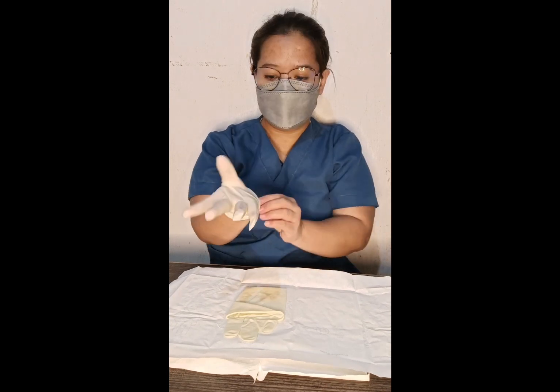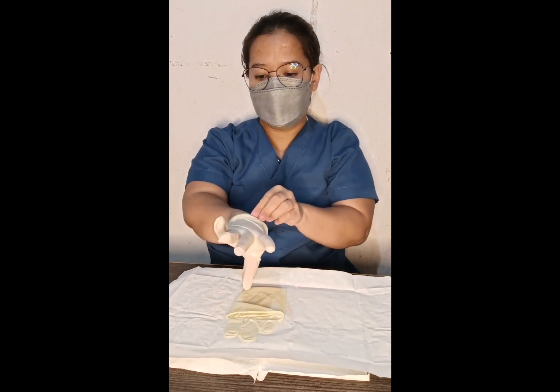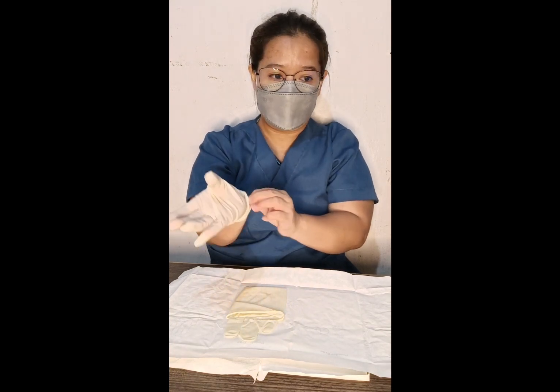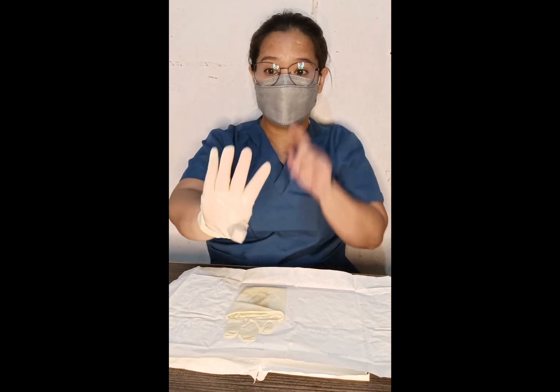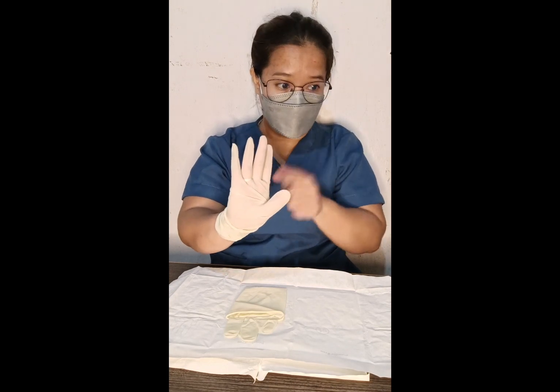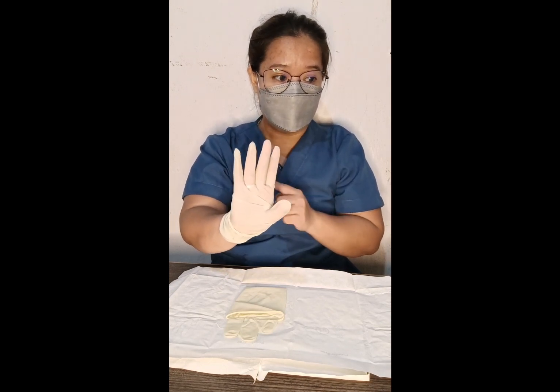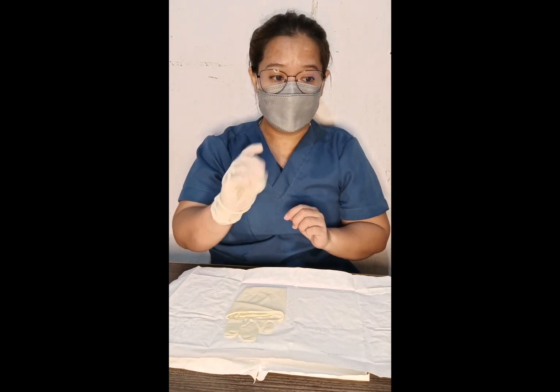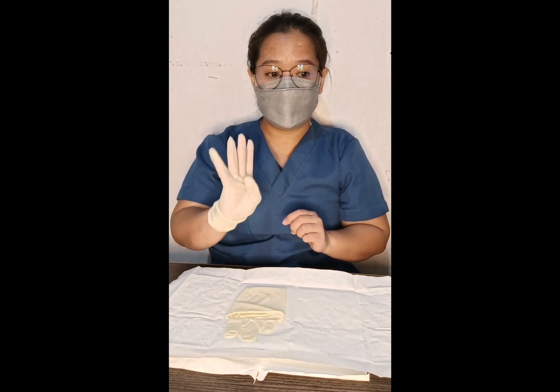Okay, so once we have put on our first glove, pull the glove on. Be careful not to touch the outside part of the glove, which is this one, because this is the sterile part of the gloves. Touch only the part of the glove that will be next to your skin. And then leave the cuff on the glove folded.